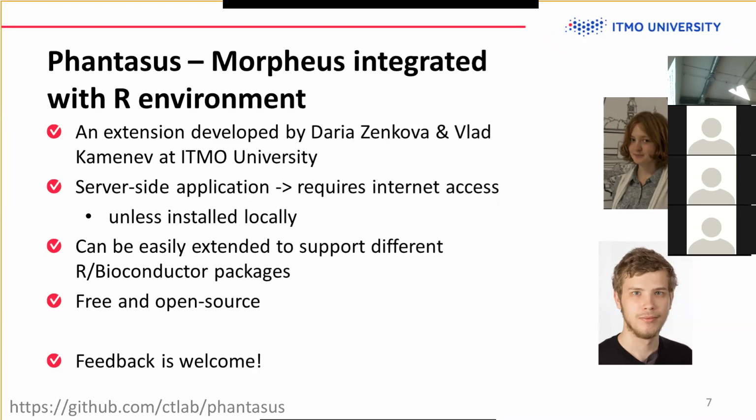So we created this tool called Phantasus. It has the same heat map interface on the client side, but it actually allows you to do a lot of analysis methods from R and Bioconductor packages. It's also free and open source. We developed this in our lab, and it's still in development, and feedback from you or anyone is welcome.